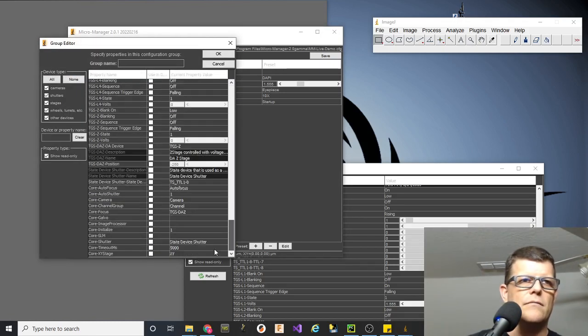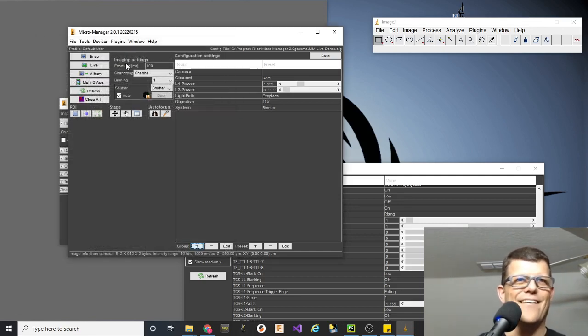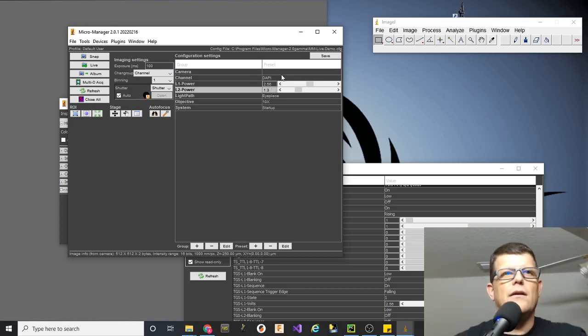So we'll go down. Let's go ahead and get laser 2. I'll probably stop here just because I don't want to bore people. This is long enough. All right, so here's laser 1, laser 2. So in this case, I could have laser 1 through 4 power. I can set the power adjust here, and then I'm only going to choose the on-off of those lasers by controlling the TTL state to trigger them on or off. So this is kind of a basic way of setting up MicroManager.